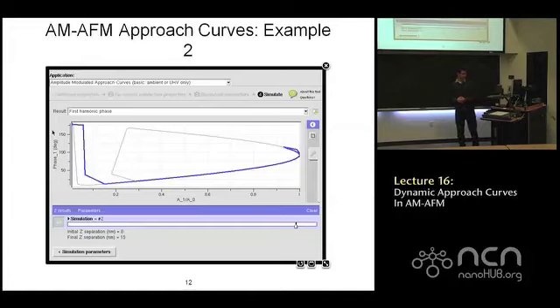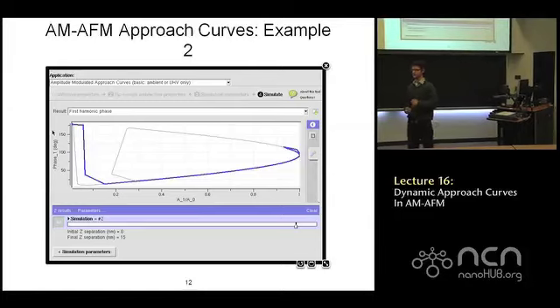Technically you can measure mean force in amplitude modulation AFM, but you're much better off looking at the phase of the oscillation. Mean force is probably pretty small, and it's not always very easy to measure mean deflections with high resolution. So what you would look at here is actually the phase of the oscillation.